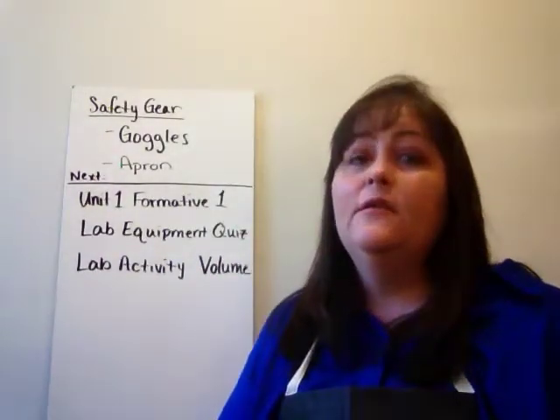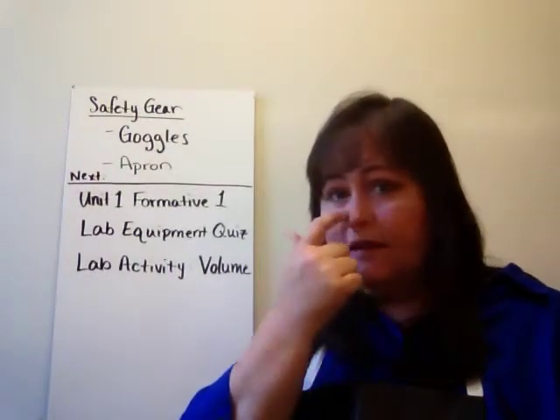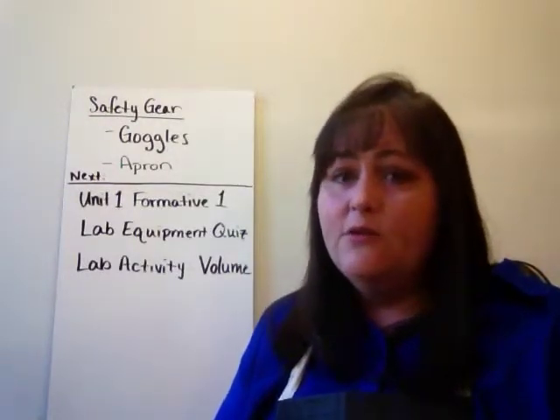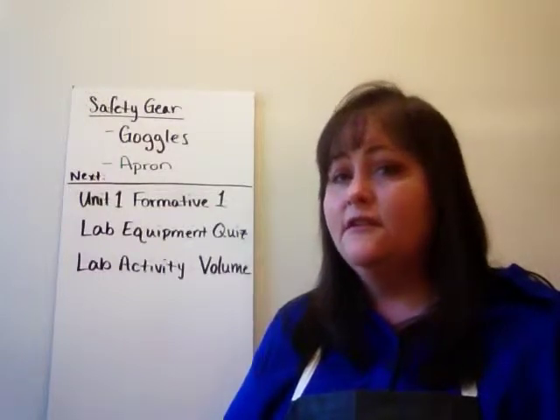When you wear them, you're going to get what I call frog goggle face. So you're going to have lines on your nose, you're going to have lines underneath your eyes, and you're not going to like that. You're not going to want to wear them, but you really do need to wear them. Do not take them off until I tell you that it's okay to take them off.